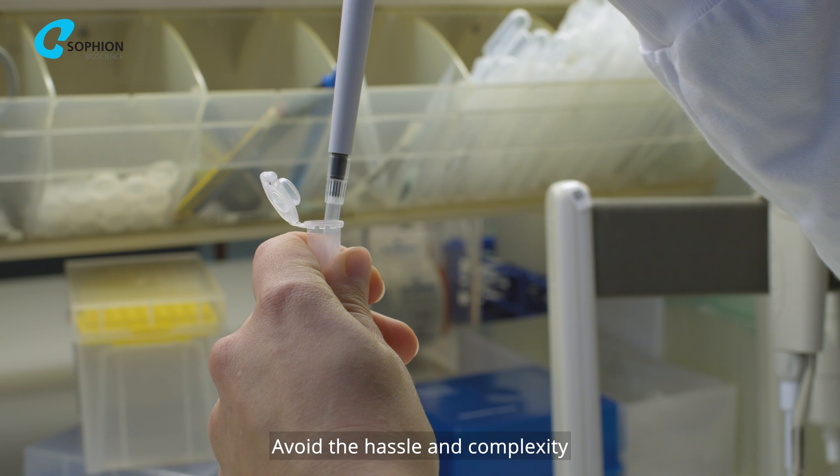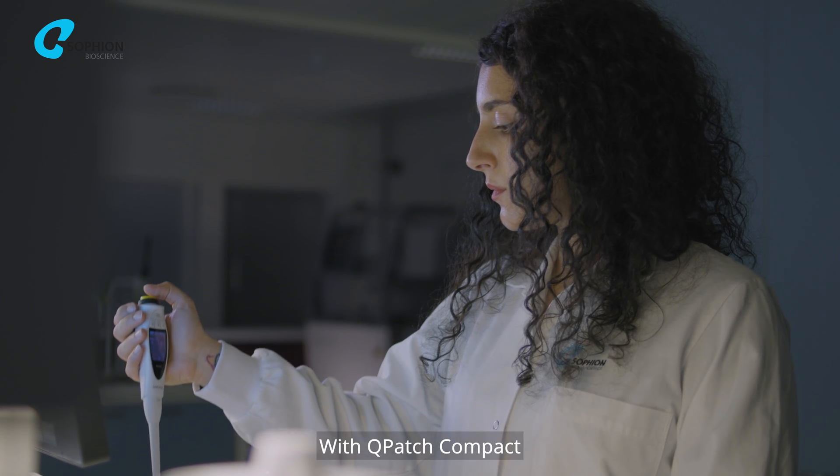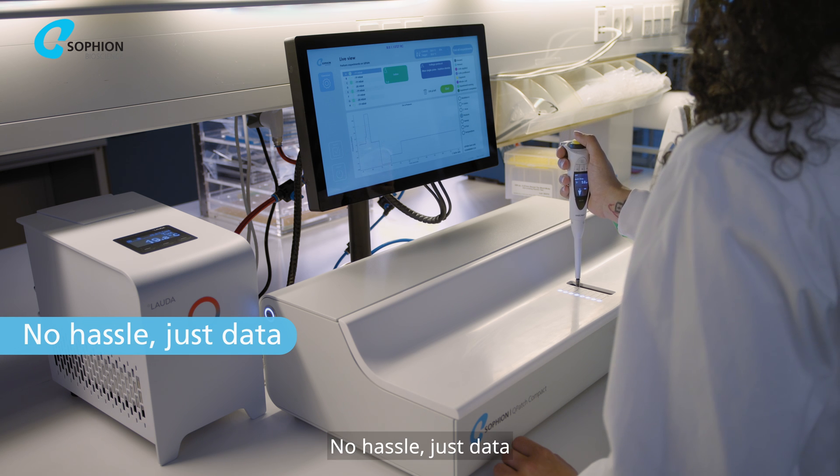Avoid the hassle and complexity of manual patch clamp setups. With Q-Patch Compact you can focus on generating data. No hassle, just data.